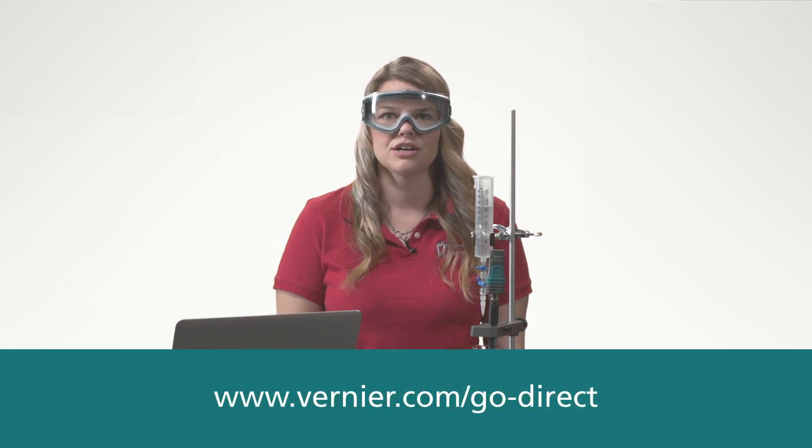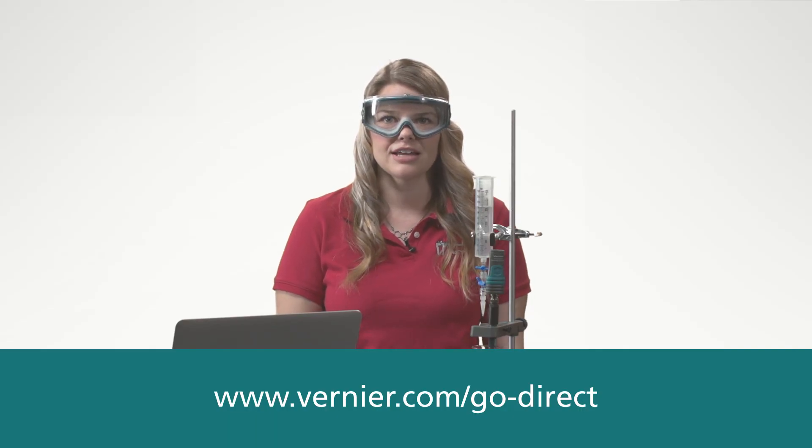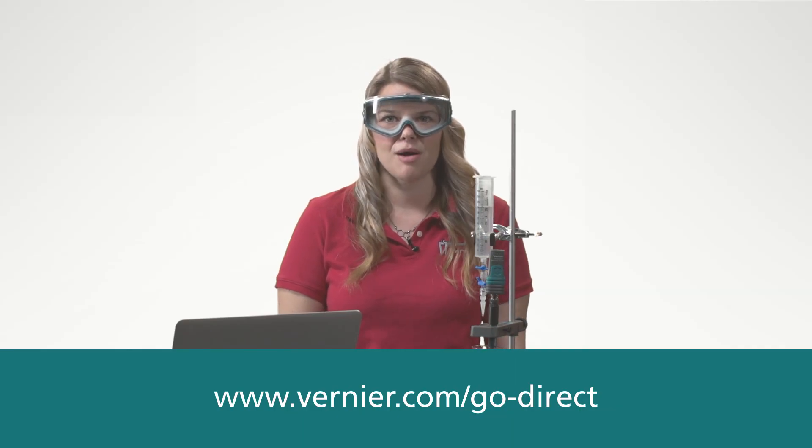Knowing the precise equivalence point, I can determine the exact concentration of my hydrochloric acid. For more information about the Vernier GoDirect pH Probe, Drop Counter, and our entire line of GoDirect sensors, visit our website or email info at Vernier.com.